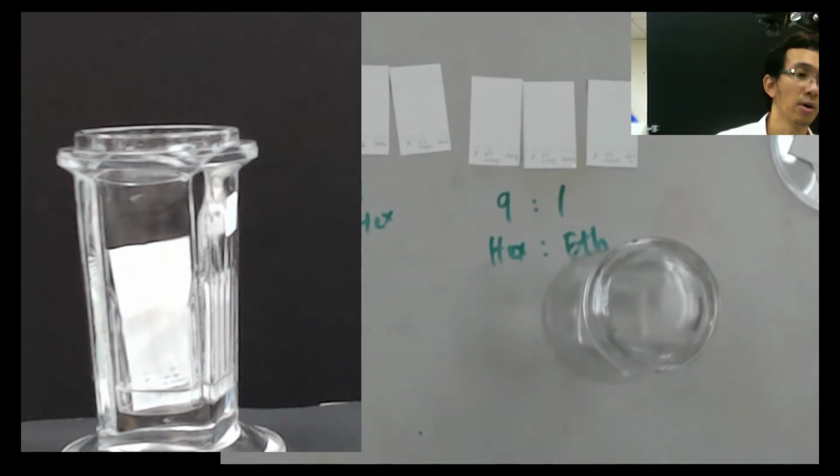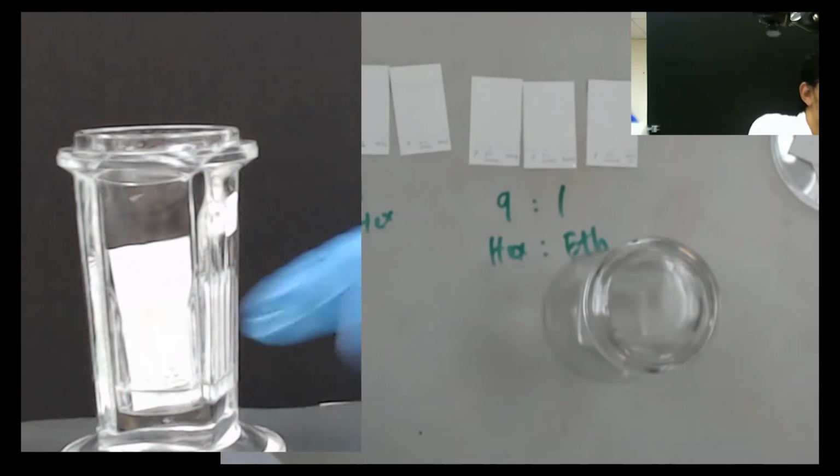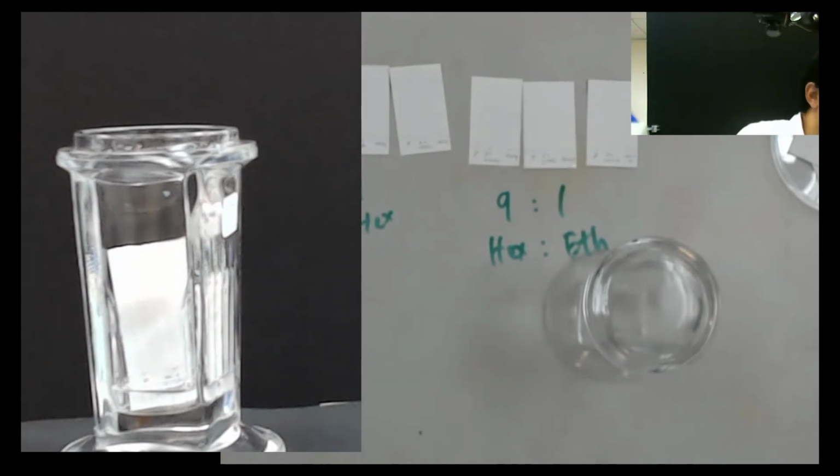So basically now, like the one we did with water and tissue paper, the water goes up. But because there is glass here, maybe the reflection from this also glass, so you cannot see very well. Because I'm using just a webcam, not a camera. So I'm sorry for that. But at least now, I just tell you what is happening. It's moving up. It's not good if you cannot see this. How about I show like this?